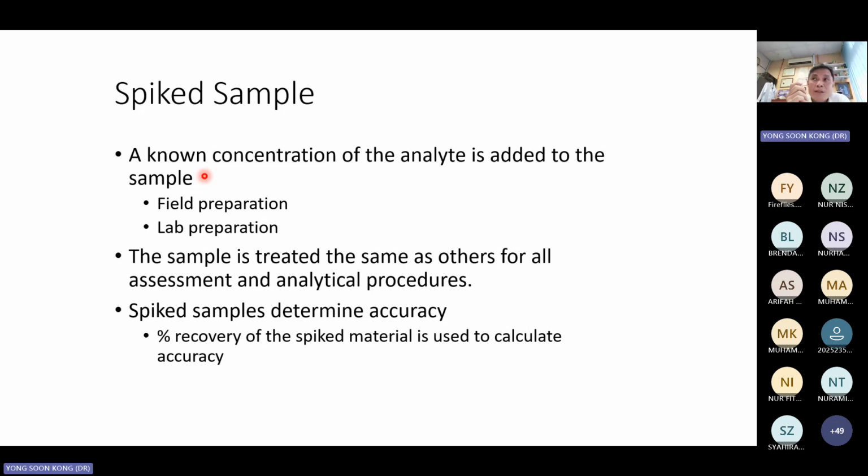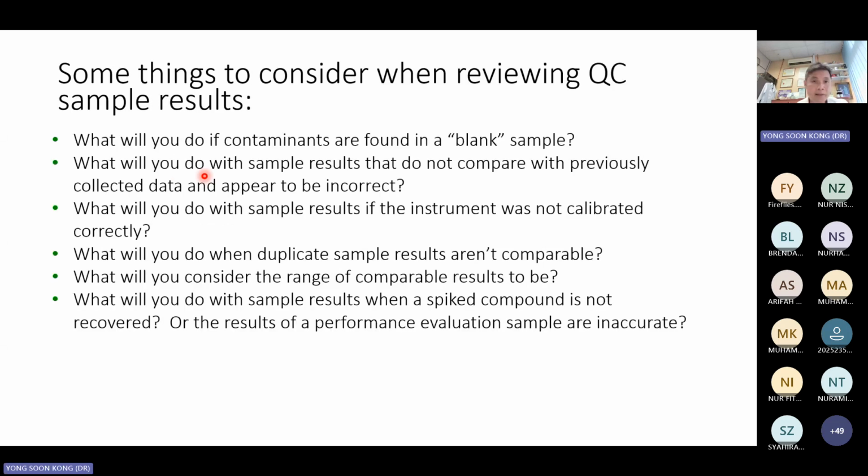Kalau you nak measure pH, soil pH, macam yang saya sebutkan hari itu, you are going to check with your standard, which is a buffer. Anything that you can check against the standard, or you can spike the sample, this is where you can kira lah, and determine the accuracy of your result. Okay, I think that is the last slide that I have for you.